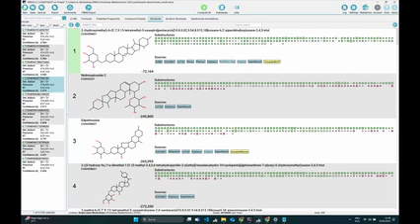What you can now see is that we don't have any reference library hits, so we don't have one spectrum which fits exactly to this compound, but what we do have is an analog hit, and this can be another validation for you. Maybe before I show this, as a repetition, you can of course right-click on this and highlight matching substructures and see, okay, most of this seems to fit quite well.